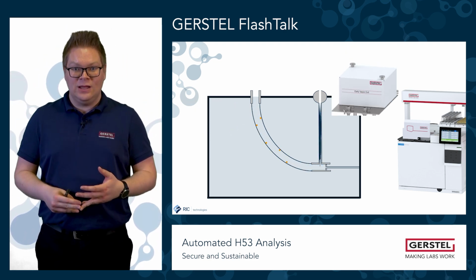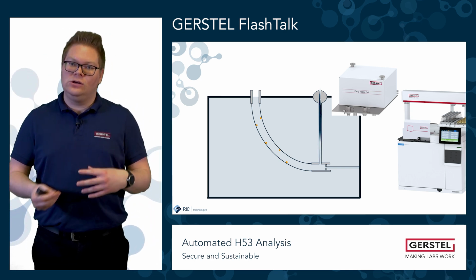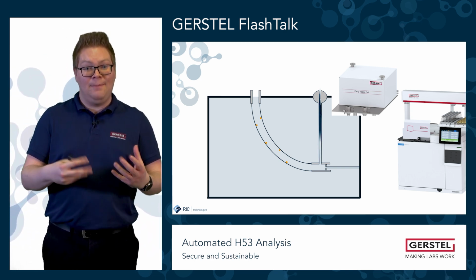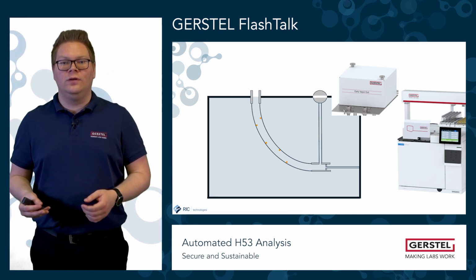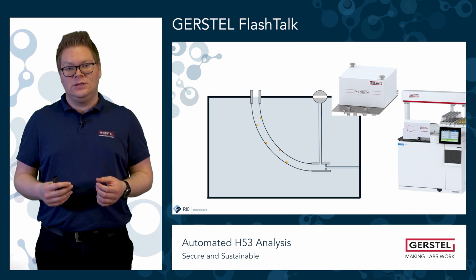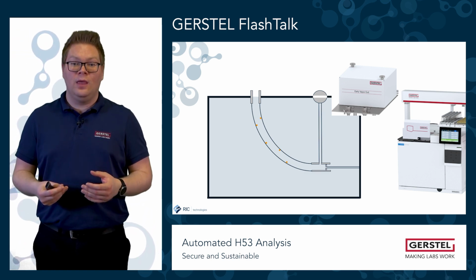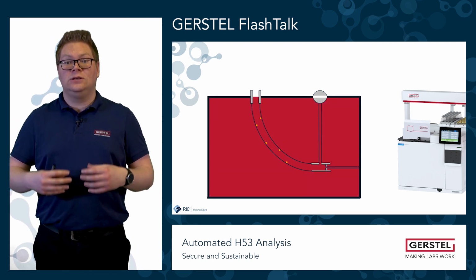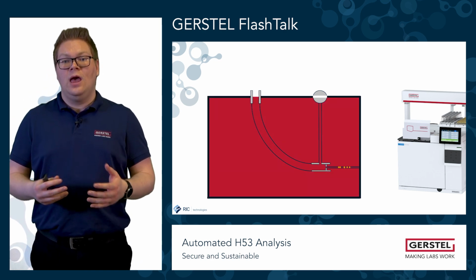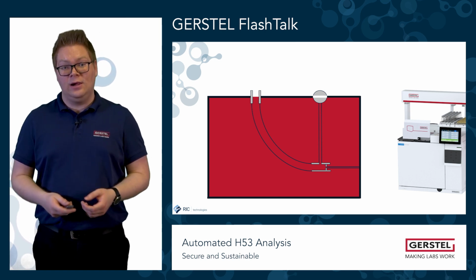This prevents the huge amount of solvent from entering the analytical column and damaging it. After the complete solvent is removed from the system, a valve inside the early vapor exit is closed, the GC oven heats up, the analytes go into the gaseous phase and are transferred splitless onto the analytical column.